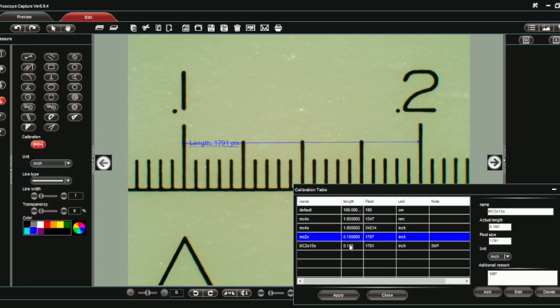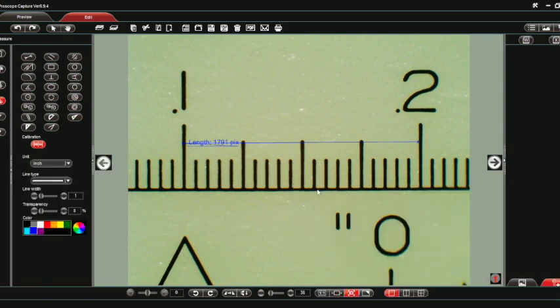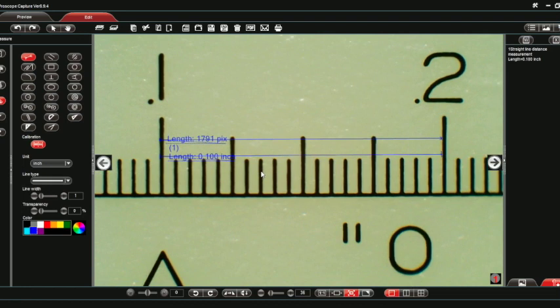To make this the active calibration, I'll click on it and then click Apply. Now that it's applied, I'll close the calibration table. I'm going to choose a measurement tool — in this case, just the measurement line. I'll click to the left hash mark and drag over to the other hash mark. The right-hand column shows that the straight line distance measurement is a hundred thousandths, so my calibration is right on.